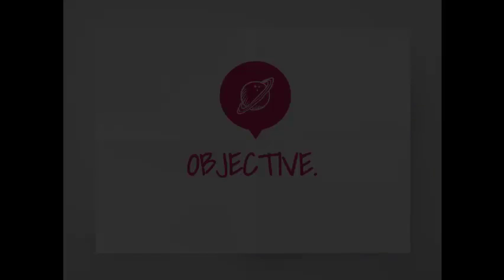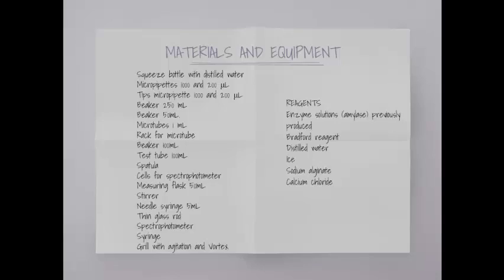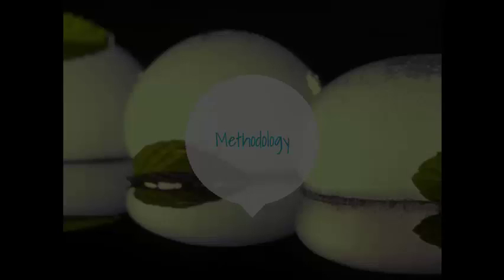Objective. General: immobilizing the enzymes contained in extracts obtained by liquid and solid fermentation. Materials and equipment: this is the equipment and materials used in the practice, and also the reagents.